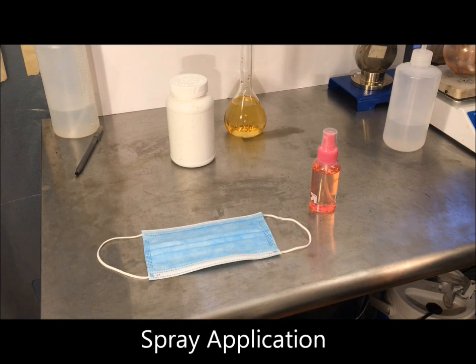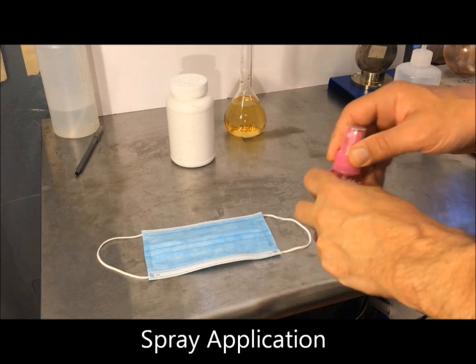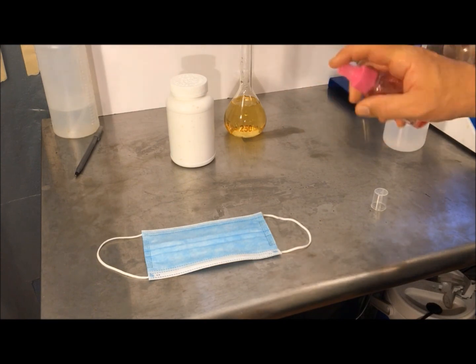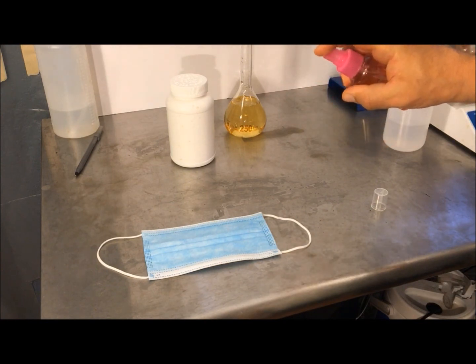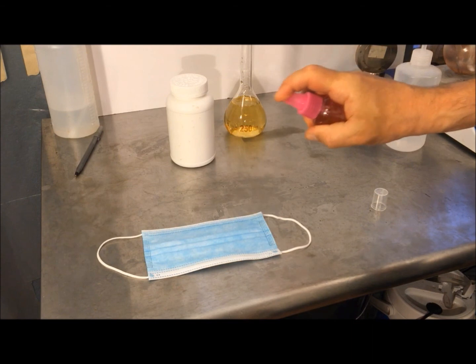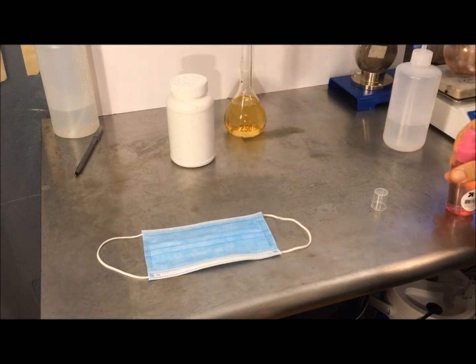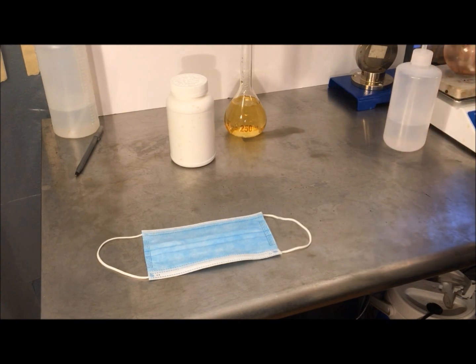The diluted product, if effective, could then be spray applied onto PPE. If you want to make the big bucks, you should probably use a car wash and a pallet of masks. Oh yeah, look at them Corona monsters run.